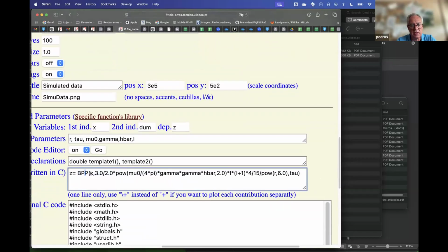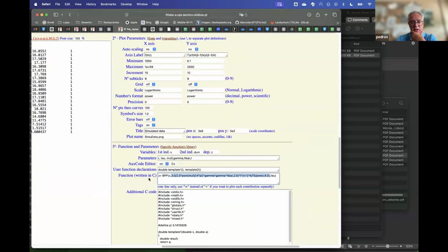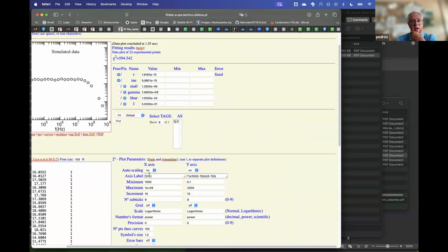You will see it's not a BPP as you might remember seeing just a moment ago, because inside this is one argument of the function BPP. So I can make calculations in the place where there would be an argument in this function. But this is typical of a programming language, so there is nothing special about this feature. But anyway, this is a BPP.